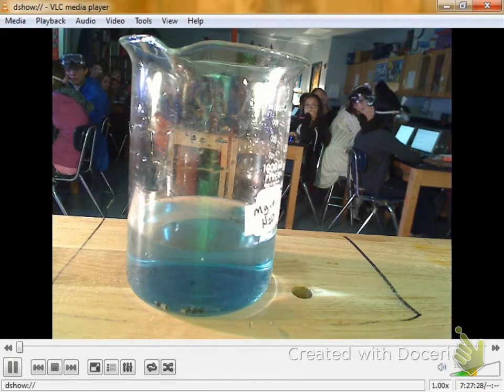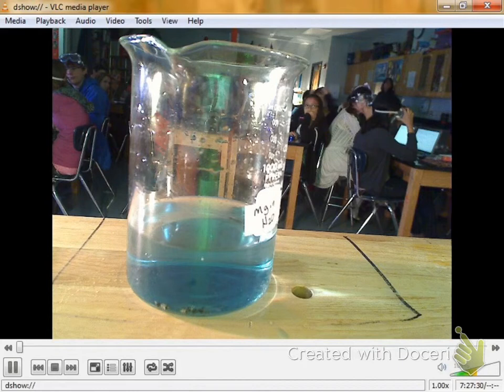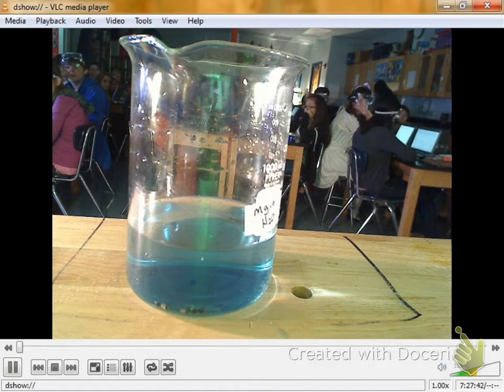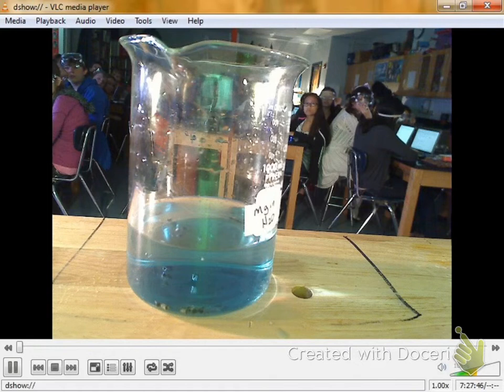Magnesium and water. Well, magnesium and hydrochloric acid, how did it react? It dissolved. Did it dissolve quickly? No. Yeah, it kind of took a little bit. Guess what? Magnesium and water. What do you think? Y'all say anything?